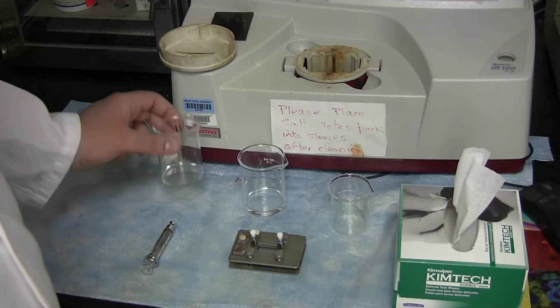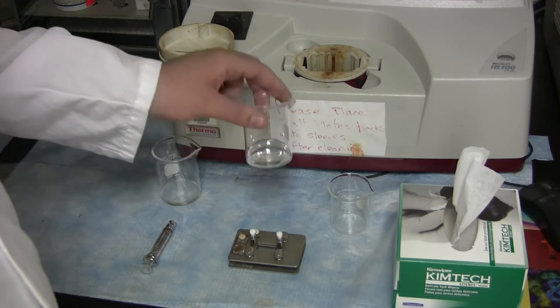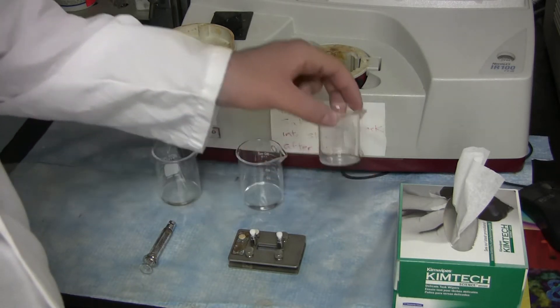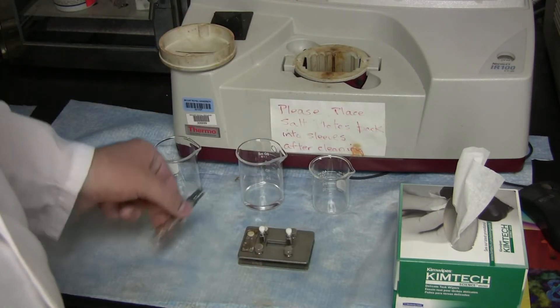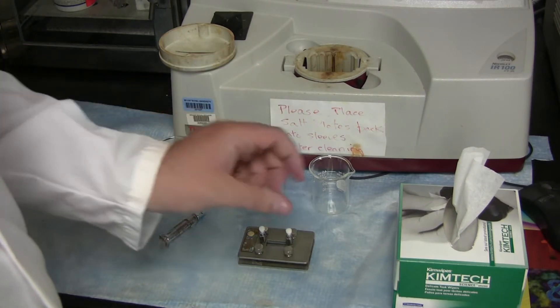You will need your solvent, your sample dissolved in solvent, a waste beaker, a solution cell, a syringe, as well as Kim wipes.